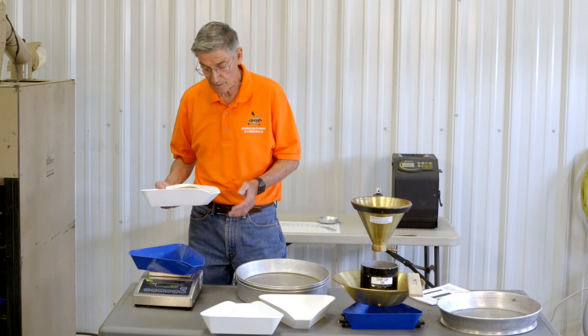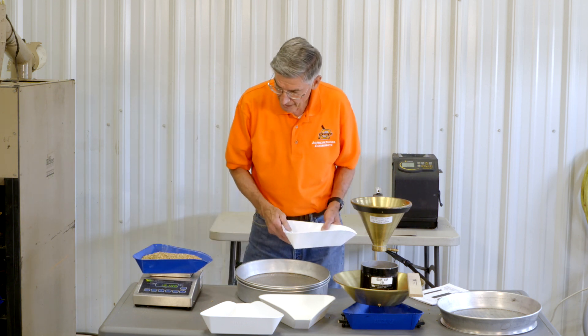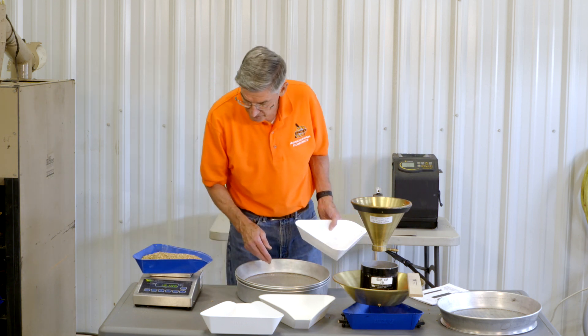Now we're going to grade wheat using hand pans. First thing we want to do is to get our original sample weight, and I have 1,010 grams.